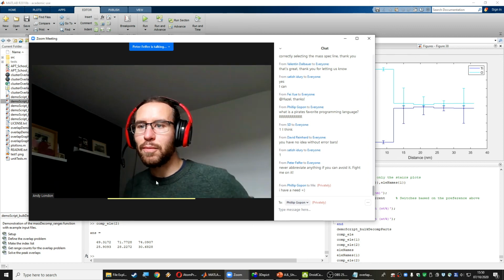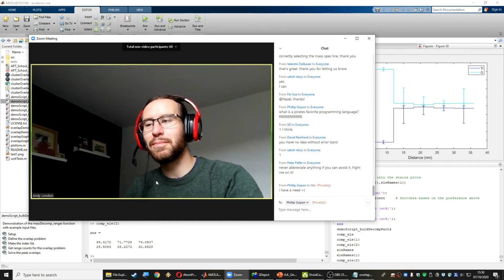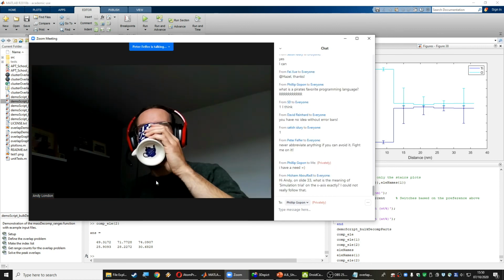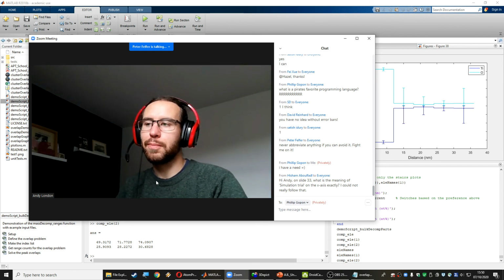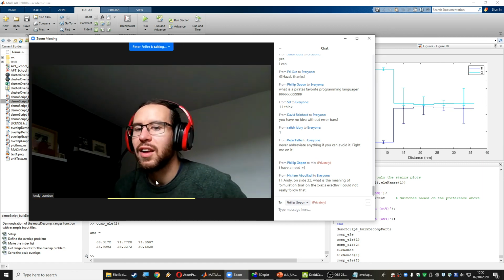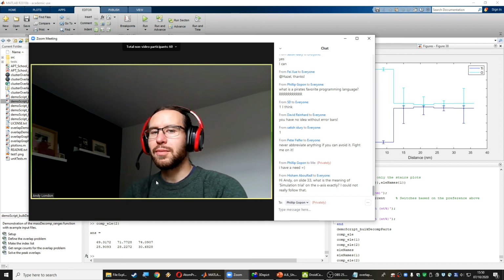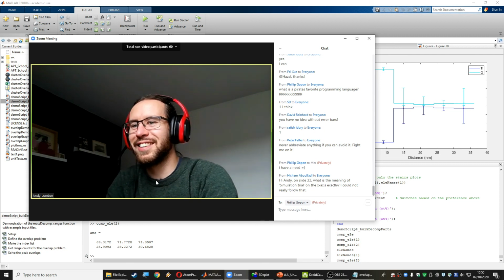Peter says never abbreviate anything if you can avoid it. Yes, but I'm also a lazy programmer. The thing is, at one point, you will have to go back into code that you've written years ago, and you have to be able to read it. It turns out the more verbose you can be, the better. I would never recommend anyone just putting in H when they actually mean histogram bins. That's going to be really confusing when you come back to it.